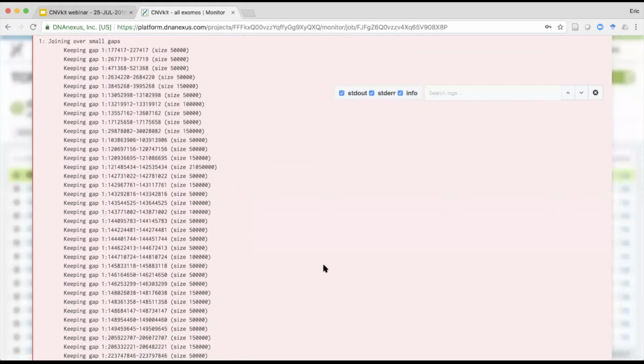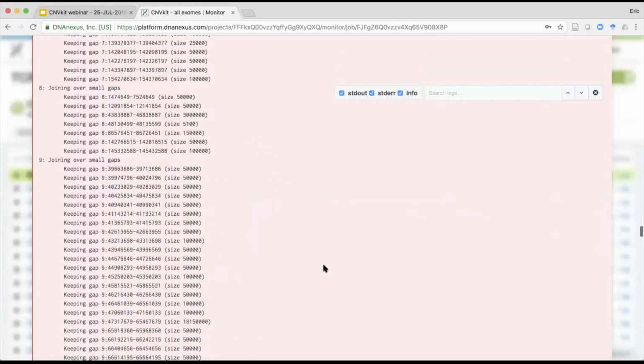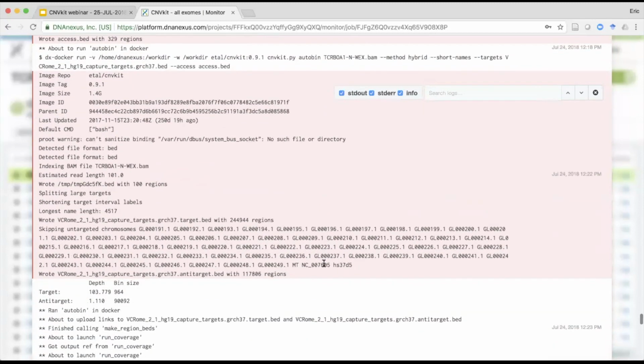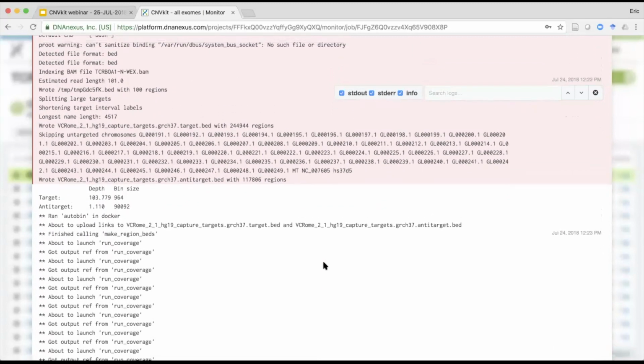Now, for just a couple N characters in a row, we probably don't care too much about masking that out because we're using coarse grain coverage. So we'll iron those out a little bit. Now we're ready for the next step. We choose one mid-size normal sample if you provided normal samples and use that to quickly estimate the on-target coverage and off-target coverage. We'll use that information to calculate a reasonable bin size if you didn't specify it.